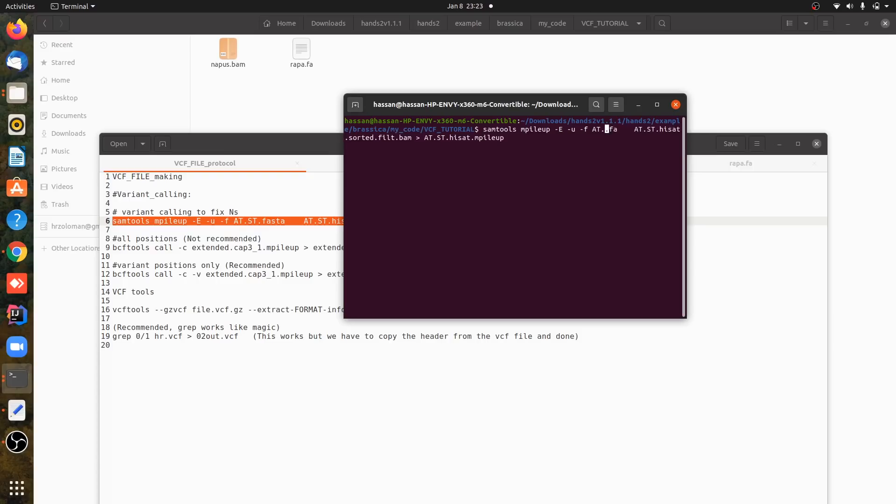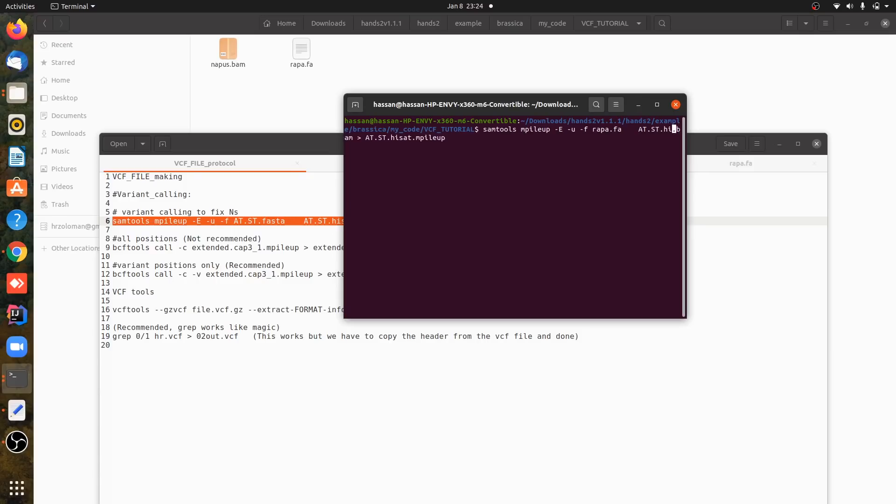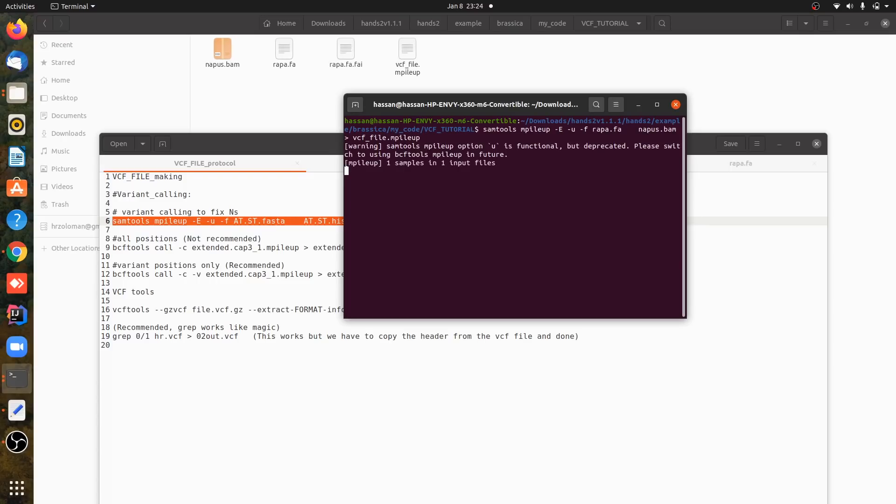And the other one is a bam file, which is nepus.bam in my case. So nepus.bam, and it will give me a VCF file. mpileup will be generated immediately. So VCF file mpileup has been generated successfully.